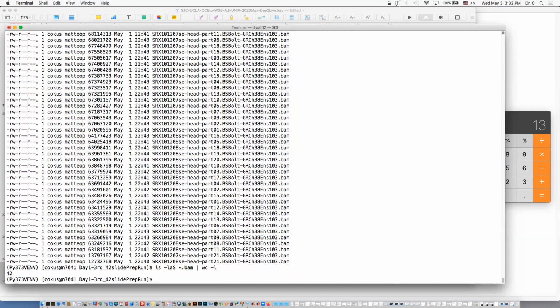Even just the BAM file sizes were indicators of run one and run number two having the bad parts. And so on. We were pretty careful there. We inspected all the log files, and we did a pretty good job of looking for where the problems were. And in general, that's what you do have to do. But in these cases, just looking at the BAM file sizes would have already told you which were the parts that had the problem. And I'm just showing you that the BAM file sizes for run number 3 look good.